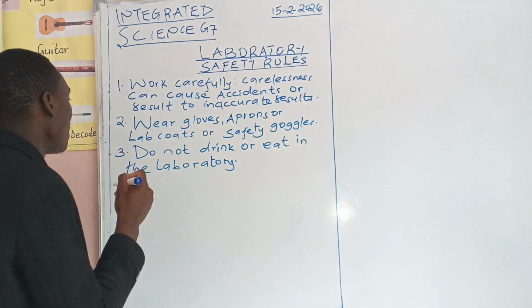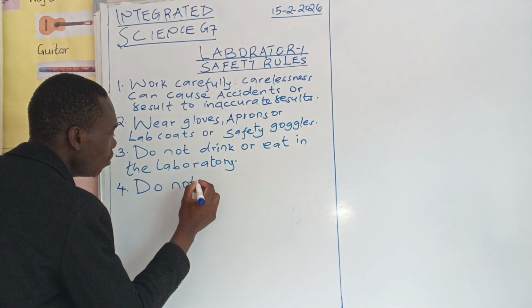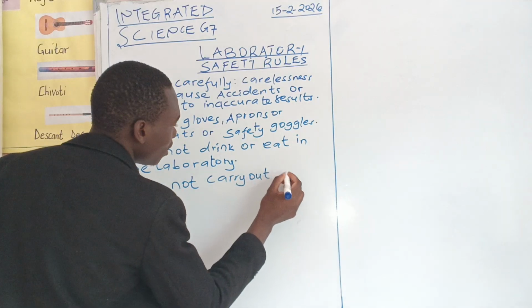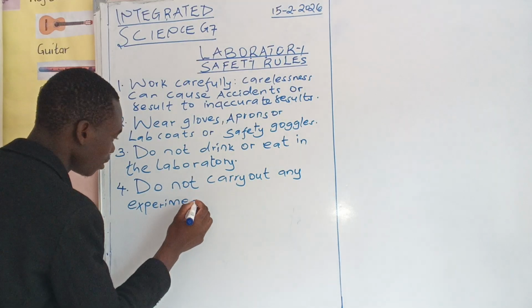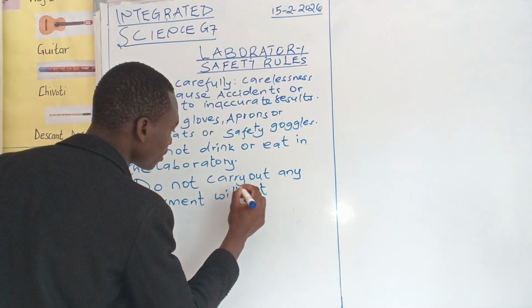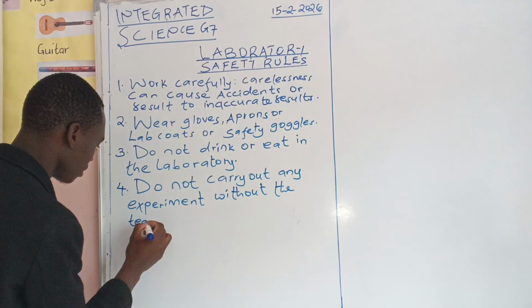Number 4 rule: do not carry out any experiment without the teacher's instructions.